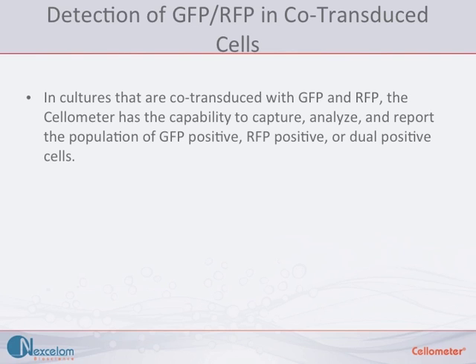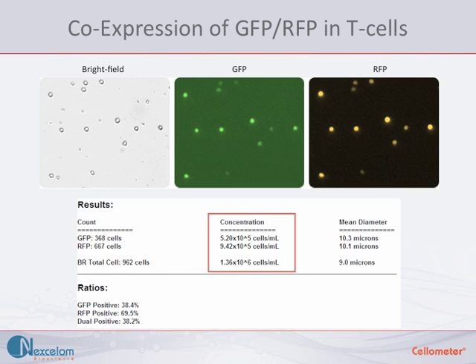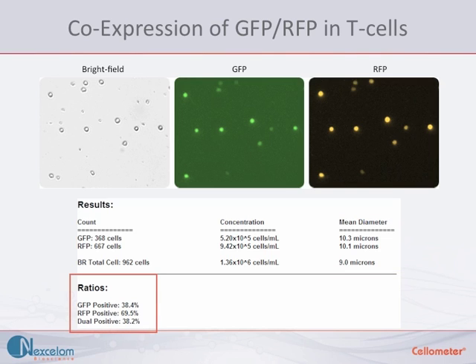The third application examines cells in a culture that co-express GFP and RFP. Cellometer can capture, analyze, and report the percent of cells that are GFP positive, RFP positive, or dual positive. In this example, we are looking at T cells that are co-expressing GFP and RFP. Brightfield, GFP, and RFP images are acquired and analyzed. The reported results include the number of cells counted for each population, the concentration, the mean diameter, and the ratios of GFP positive, RFP positive, and dual positive cell populations. In this example, about 38% of the cells are both GFP and RFP positive.